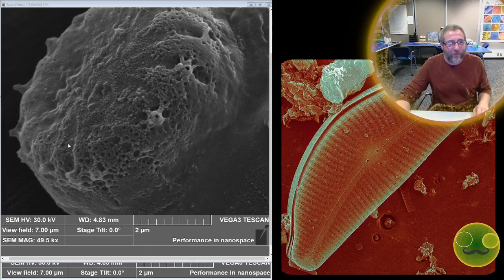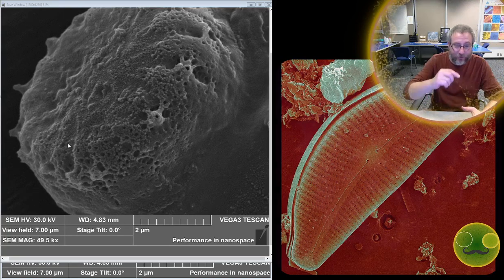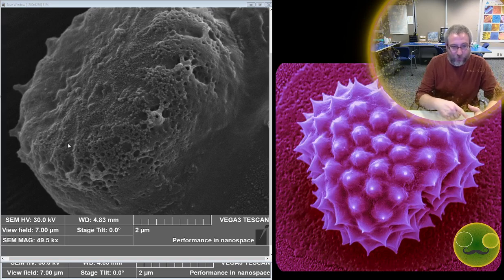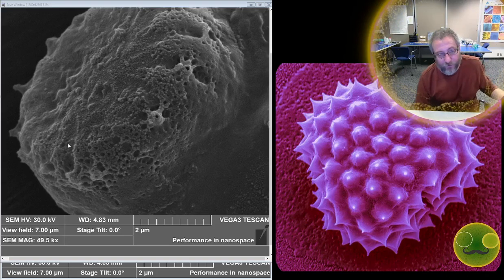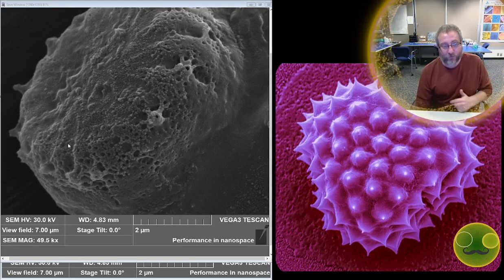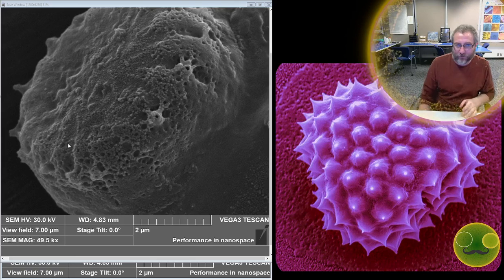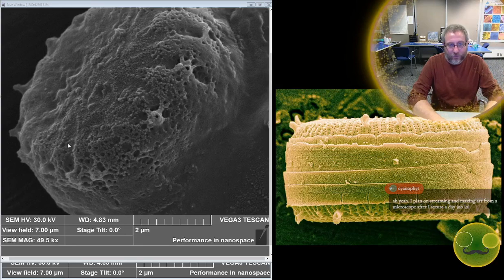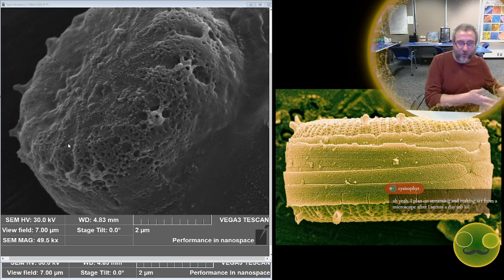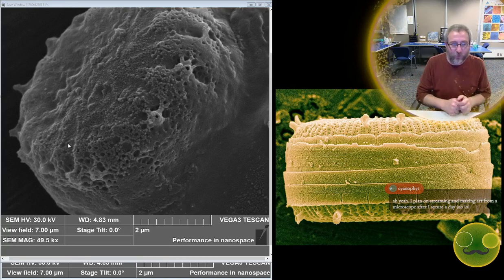This scanning electron microscope also has a backscatter detector, which may be what you were trying to ask me about. These are the electrons that go a little bit deeper into the sample and interact with the specimen, and then can't come as far off the surface as the secondary detector would detect them. They're captured by a much closer sensor called the backscatter detector. Backscatter detectors can tell you something about the density of the materials you're looking at. If you wanted to look at two different metals, for example, the backscatter would let you tell that this one is iron and this one is nickel, or this one is tin and this one is nickel, because the differences in density would be very apparent.